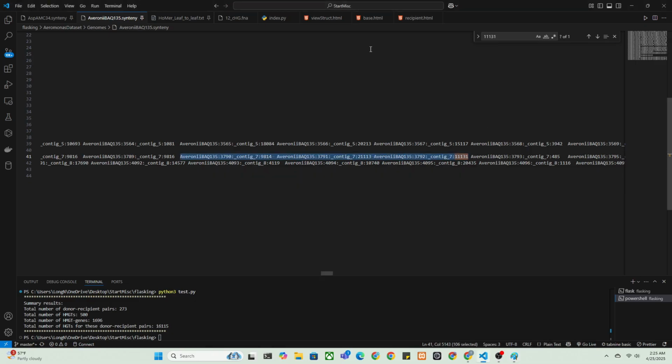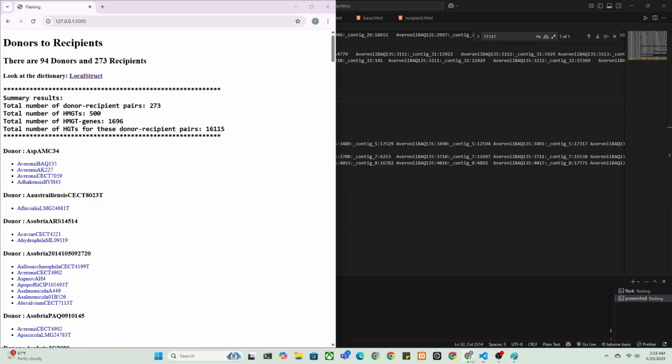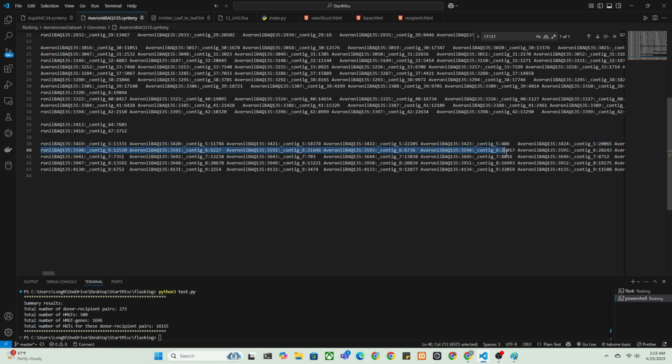And then, not this one. So we found out that this is in order. So for the next part, we would add it to this page saying it's in order, and then hopefully we can just pick out, oh, what happened?